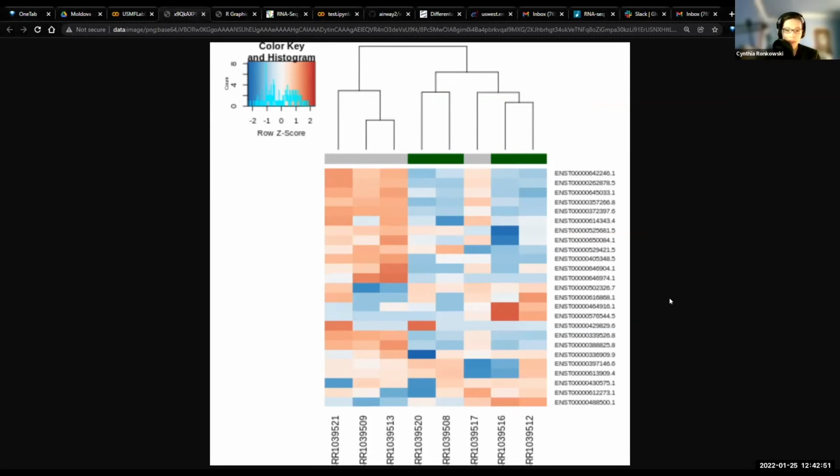So when it comes down to picking them, you'll have to look through the documentation for the specific details of what all the things in the plots mean, and how they generate that. Then you can make an informed decision about whether you want that particular data visualization in your paper. I see. Thank you very much. Happy to help.